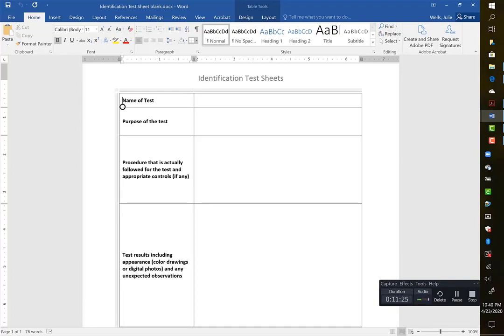How long are you incubating? So how long do we typically incubate that test? At what temperature do we incubate this test? Some of our tests go 48 hours. Some of our tests could be done in as little as, remember, 2 hours if they're a rapid test. So you want to include at least that much detail.